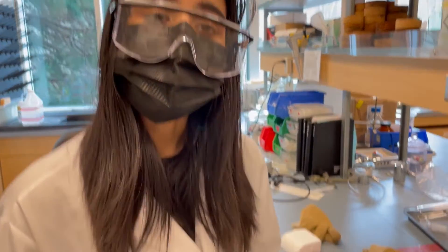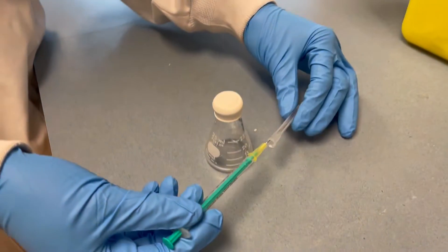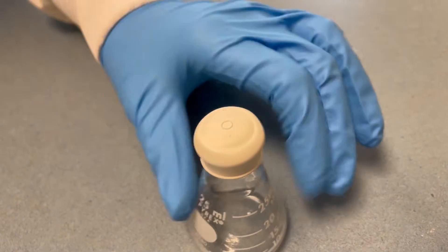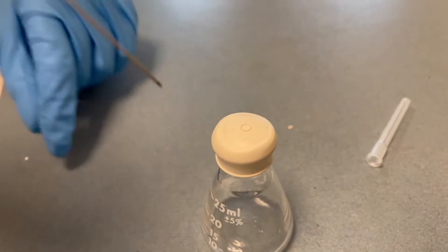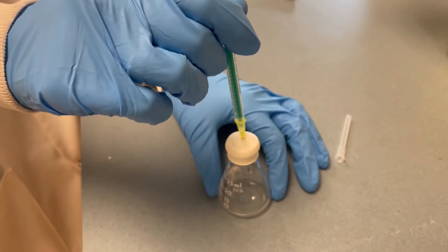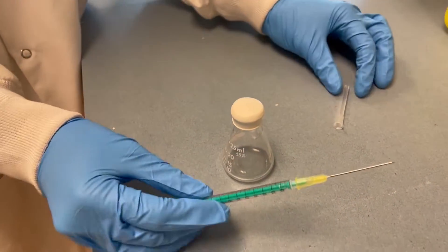When using a needle with a septum or a sure seal bottle, you want to try and aim for the middle of the septum as that's going to be the thinnest and most easiest to puncture through. Just go in like that and to pull out go slowly and it'll come right out.